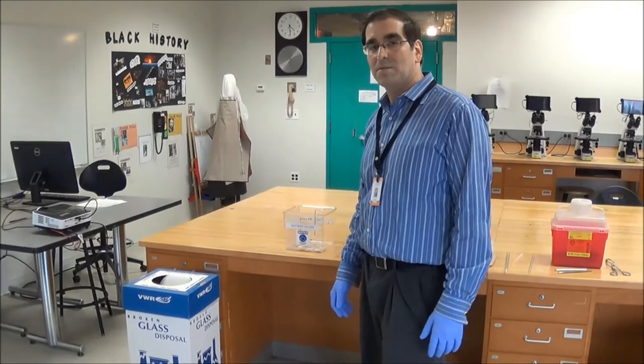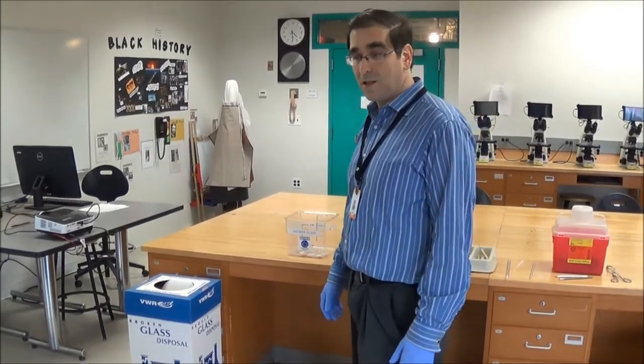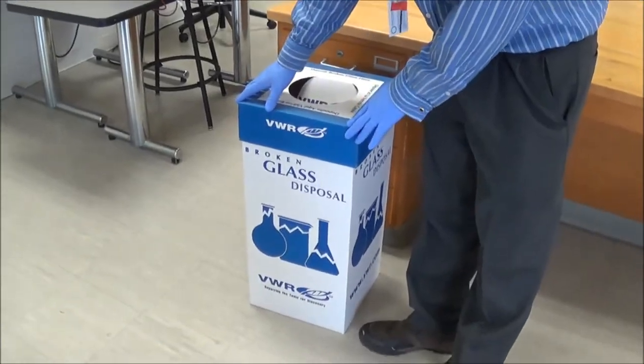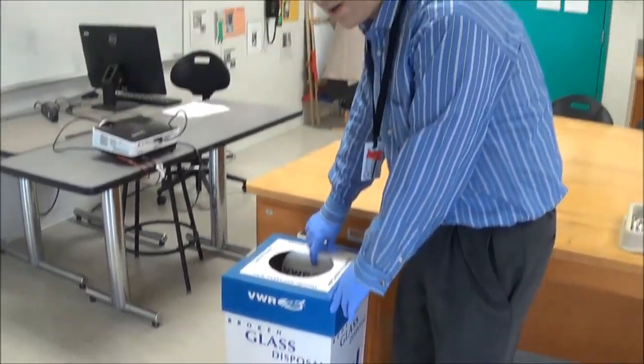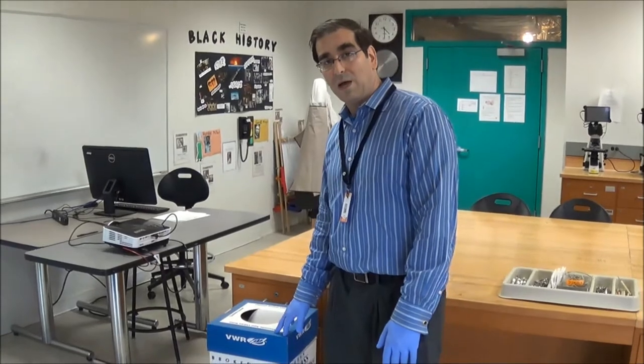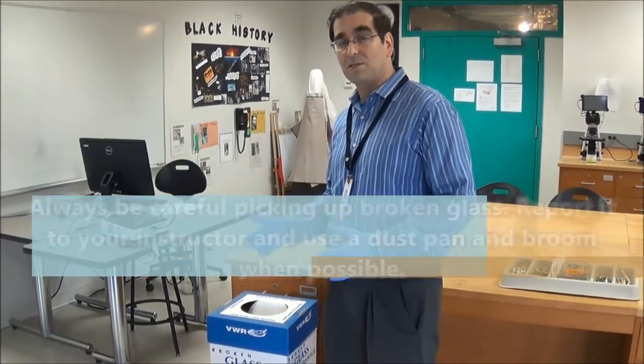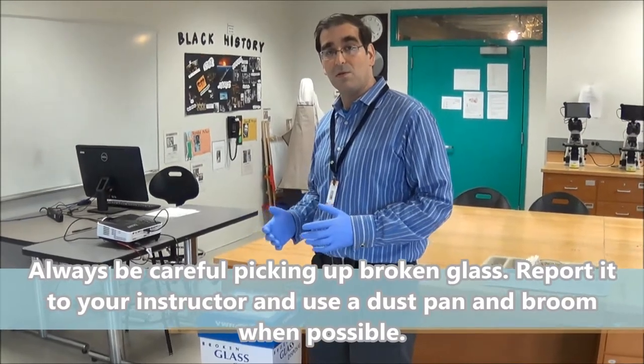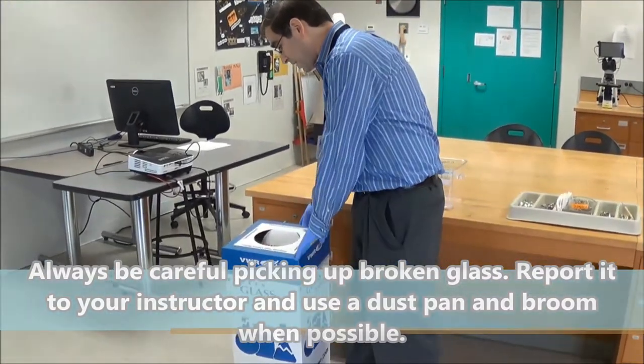There are two types of glass waste containers you'll find in the lab. One is a large cardboard container with a flap on the top. This is where you put most of your large type glass waste. So for instance, if you broke a graduated cylinder or an Erlenmeyer flask or something along those lines, that would go into this kind of container.